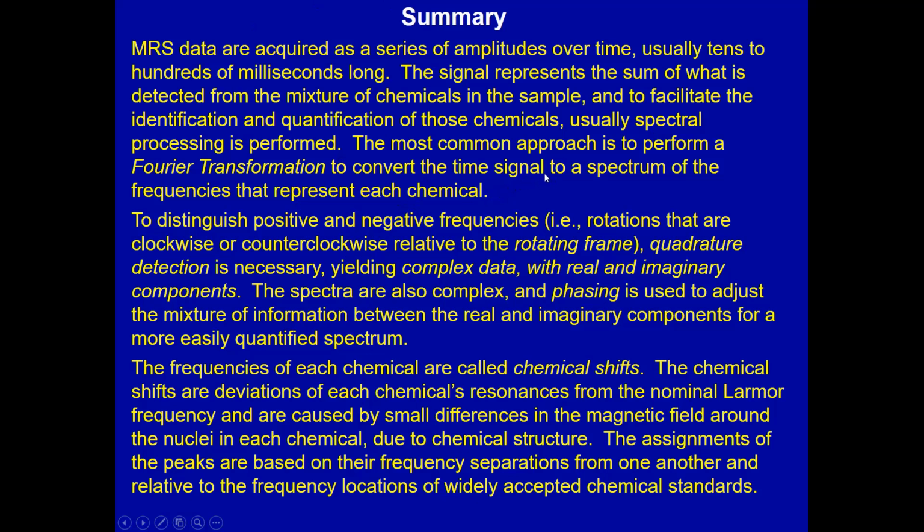That's frequency. For imaging, we acquire our data in time also, but as I will explain in a later lecture, there's actually a scaling factor that gets applied. It converts that time of an image into something called k-space, or also called reciprocal space, or inverse space. It has units of 1 over centimeters, or 1 over millimeters, 1 over inches. When we do a Fourier transform of that 1 over distance axis of our time domain image signal, it becomes distance.